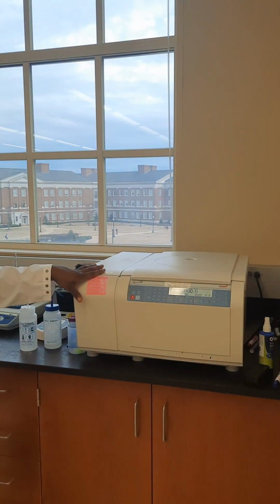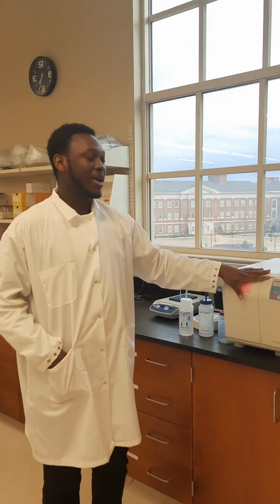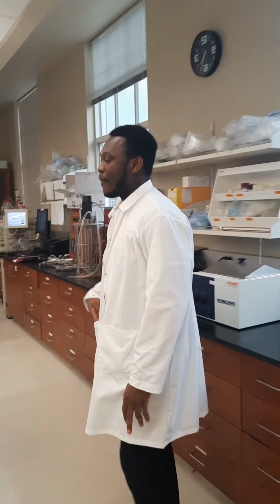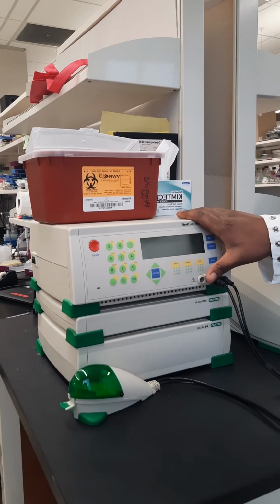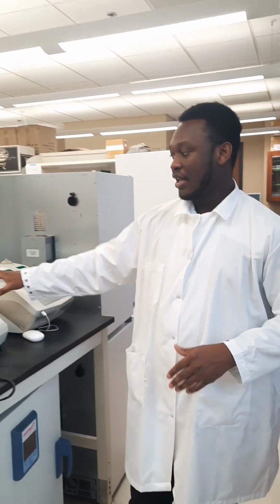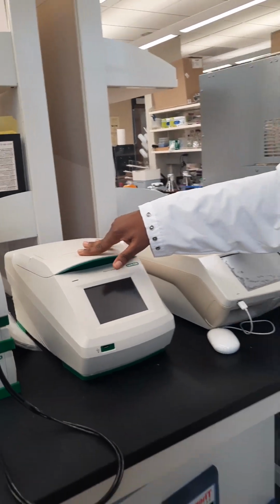Basically, after our protein production and after lysing our cells using the sonicator I earlier showed you, we are going to centrifuge to separate the cells from the protein produced. This is what we call the electroporation machine, and what it does is to allow foreign DNA to enter into our cells. So basically, we are pulsing our cells using high voltage to allow foreign DNA to enter. And this is the thermal cycler, which carries out the polymerase chain reaction, and it's used to produce thousands of copies of a target gene.